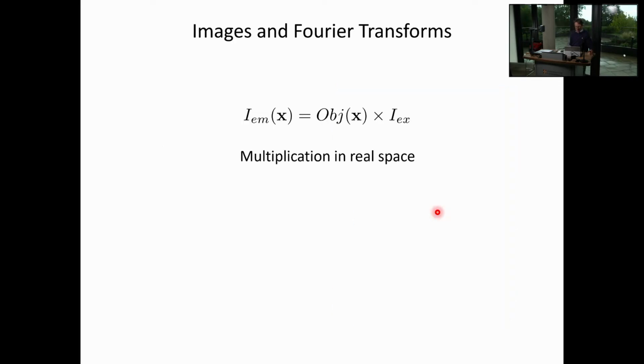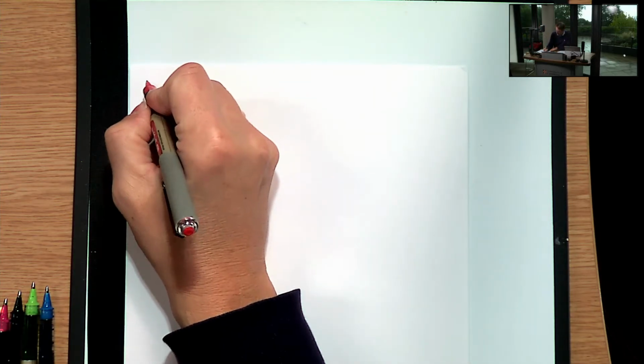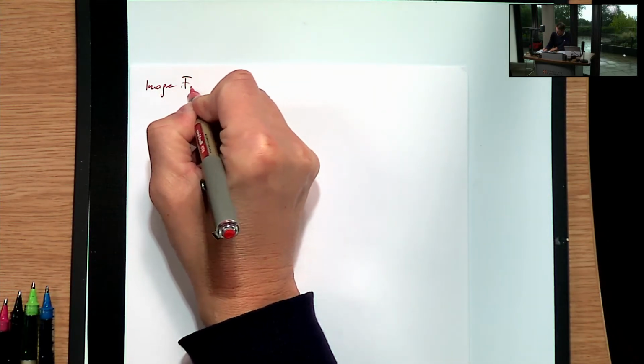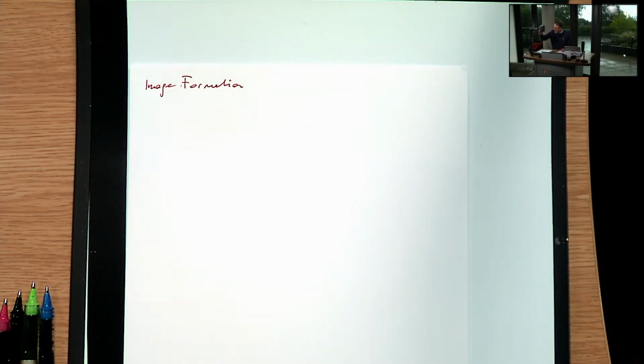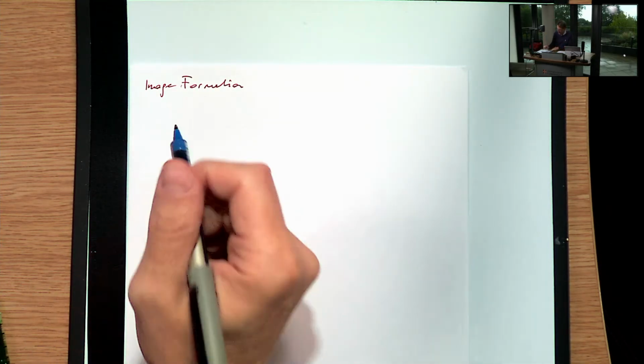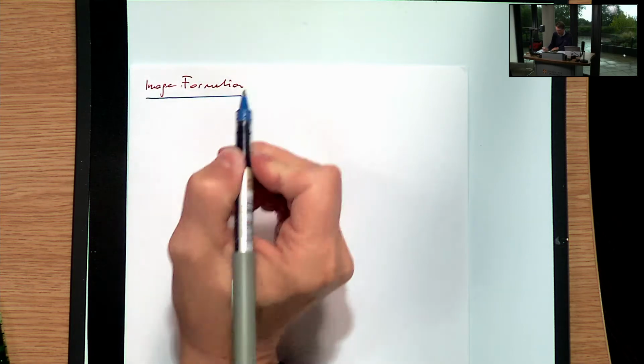And with that, I would like to now turn to the paper visualizer, and let me just turn this on. I'll go out here so you won't lose focus. Let's just see that image formation. I'll just focus this. So is that focused? Okay, so let's go back to the basic problem of how an image is formed in a microscope.